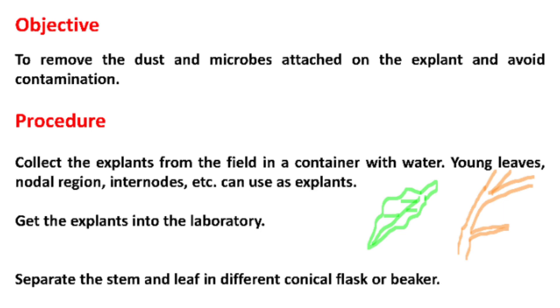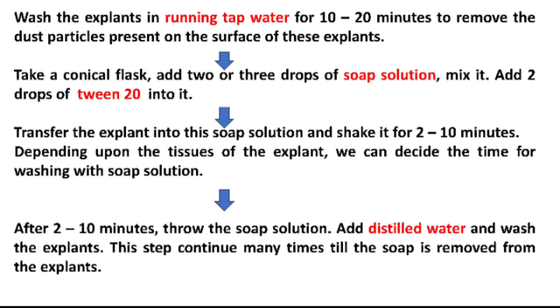Collect the explants from the field in a container with water. Young leaves, nodal region, internodes, etc. can be used as explants. Get the explants into the laboratory and separate the stem and leaf into different conical flasks or beakers. Wash the explants in running tap water for 10 to 20 minutes to remove the dust particles present on the surface.